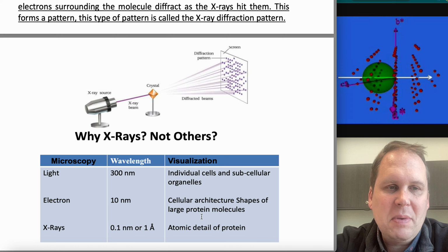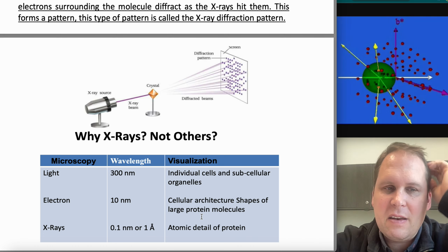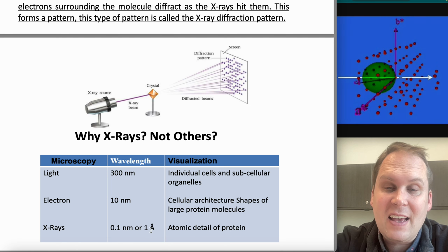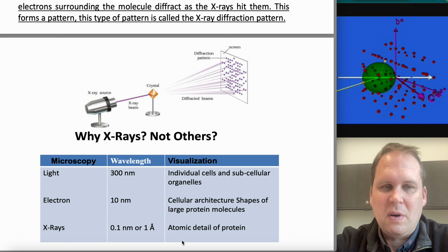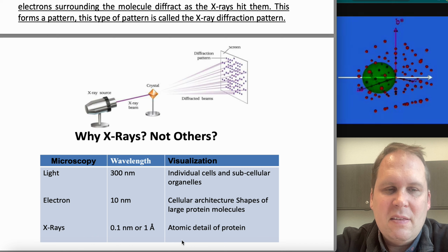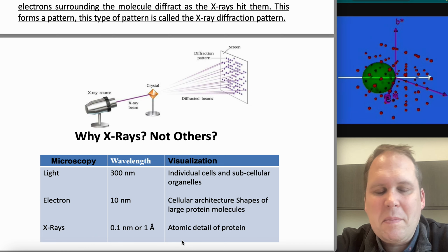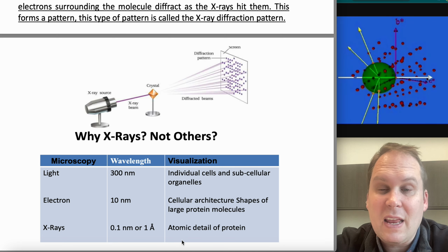The protein can be floating around in water that you freeze as ice, but they're in sort of random orientations, basically doing what they were doing at the moment before you froze them. Really nice. Anyway, X-rays are teeny tiny. They're about 1 angstrom in size. And so on a good X-ray reconstruction, you can get down to 2 angstrom resolution. That happens with the best structures. Most of them end up being in the 2 to 3 or 3.5 angstrom resolution range.